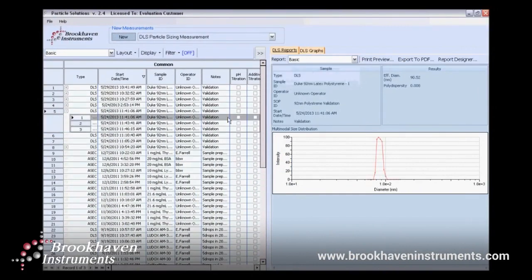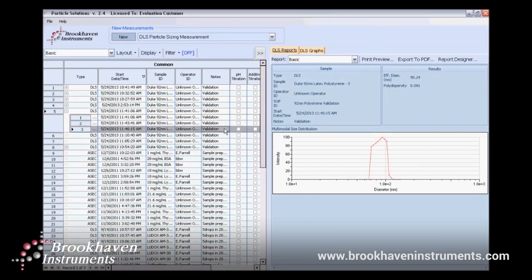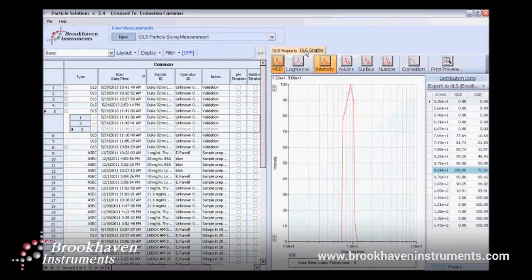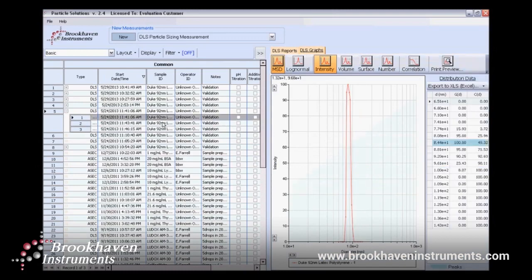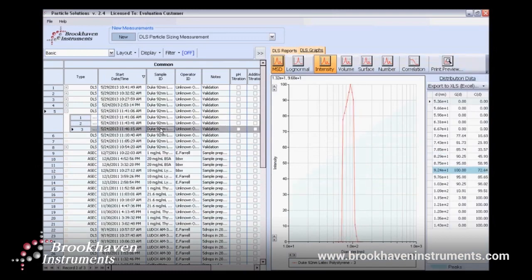This is the Particle Solutions main window. As you can see, my database of samples is on the left side and the details or the results are on the right.